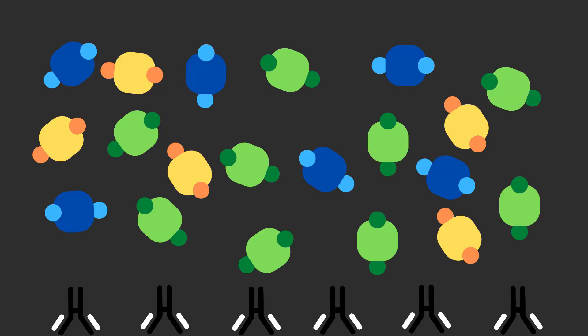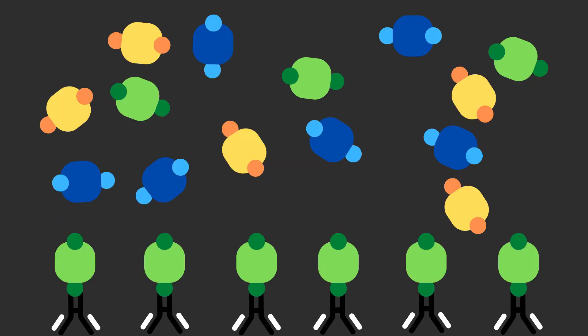Second, the sample is added and any antigens present in the sample that are specific to the capture antibodies bind to them. Then the well is washed to remove all unbound sample components.